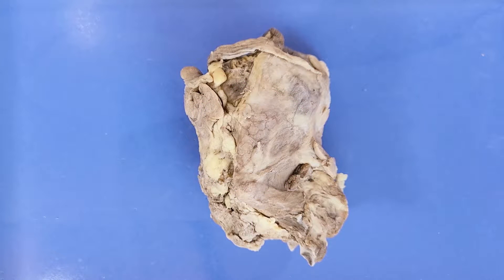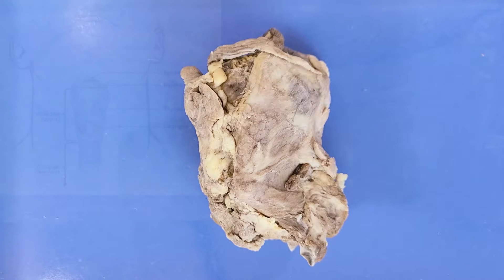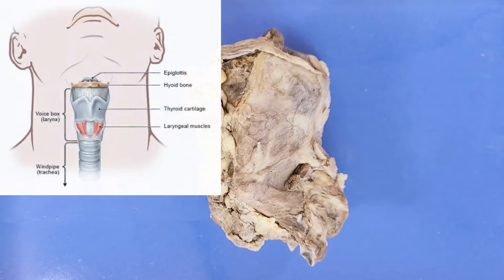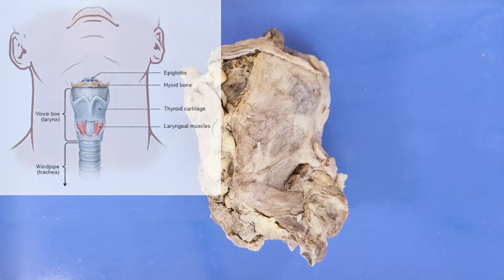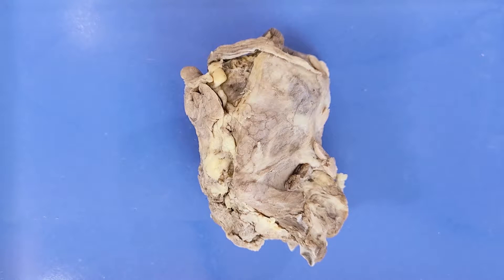Hello and welcome to O-Wyrm. Today we'll be taking a look at the anatomy of the larynx. This is a sheep larynx, which is pretty similar to a human larynx. The larynx is a segment of the respiratory tract that connects the pharynx, which is above it, to the trachea, which is below. It is located in the top of the neck and is involved in functions such as breathing, producing sound, and protecting the trachea while swallowing. The larynx also houses the vocal cords, which is why it is sometimes called the voice box.